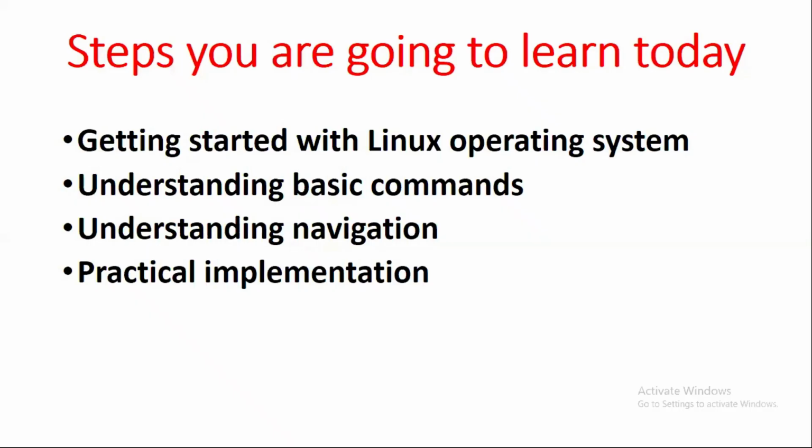In the very beginning, I will tell you where to get and how to install your Linux operating system. I will not show you how to install it, but I will give you a very specific link to a video that I also watched and learned how to install Linux onto my computer. Okay, so let's start with the video.